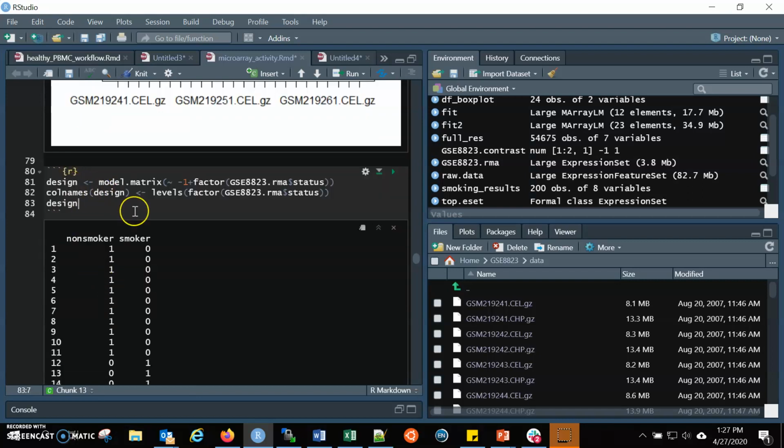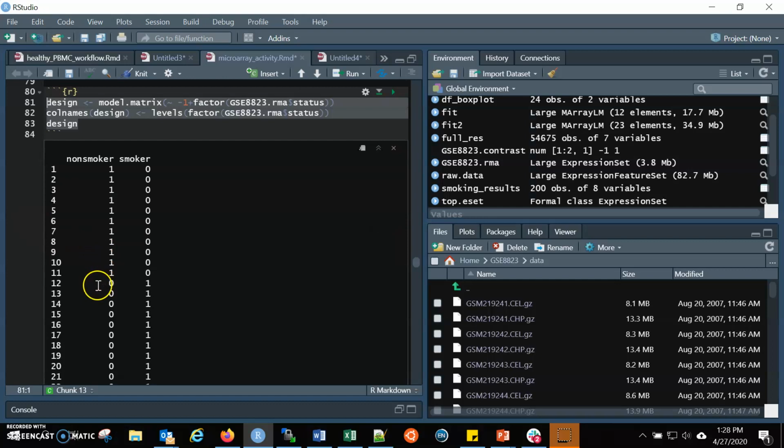And so now we need to set up our analysis, what we're considering one group and what we're considering the other group. Our two groups, just as a reminder, are non-smokers and smokers, and we're comparing the gene expression between those two specific groups. You don't need to know a lot about what this specific line of code within R does, just that it assigns our specific smokers to a specific group.